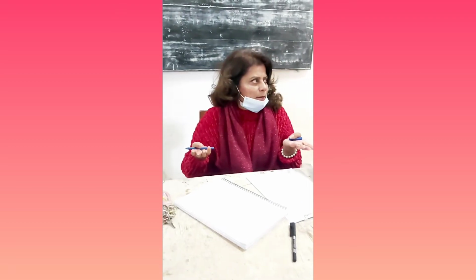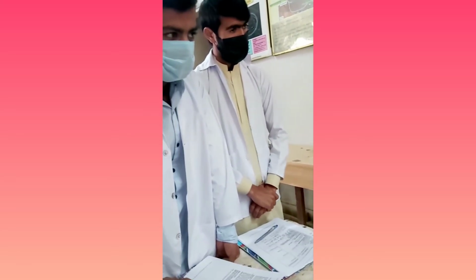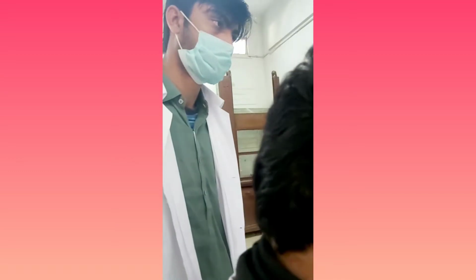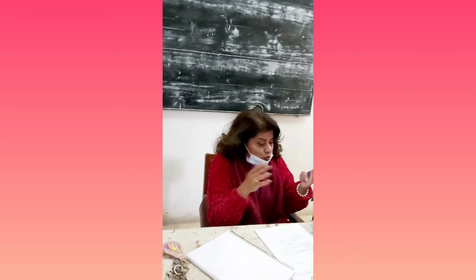Now the question arises, our compound is benzoic acid, right? So why are we going through all these tests? We know the structure of the compound. We know that it doesn't contain nitrogen, it doesn't contain sulfur, it doesn't contain halogens. So why are we doing it? For your practice. It's a known compound. You know the nature, the structure and the formula of the compound. So in that sense, you are going to match your findings with the findings given here, and you will come to know that nitrogen is not there. We have confirmed it through the test.